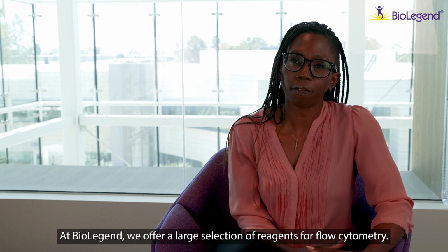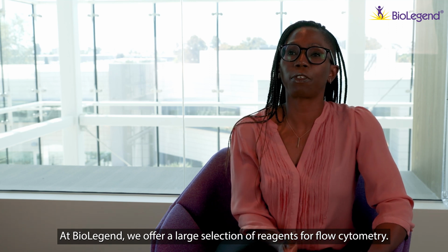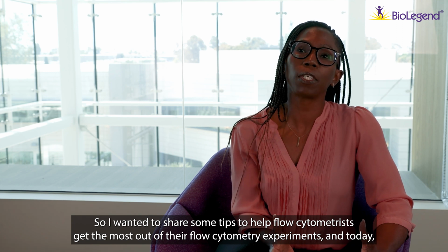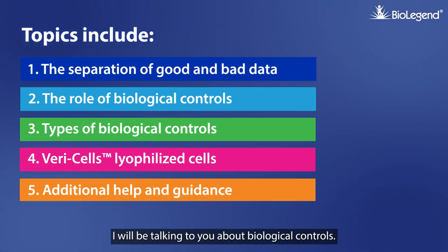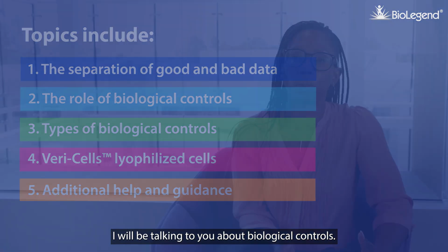At BioLegend, we offer a large selection of reagents for flow cytometry. So I wanted to share some tips to help flow cytometrists get the most out of their flow cytometry experiments. And today I will be talking to you about biological controls for flow cytometry.